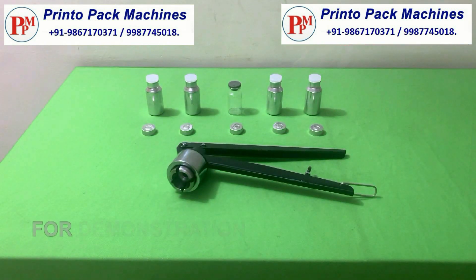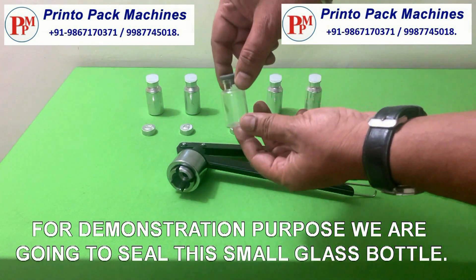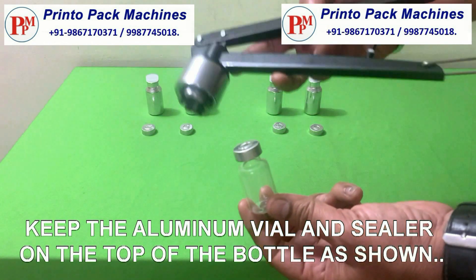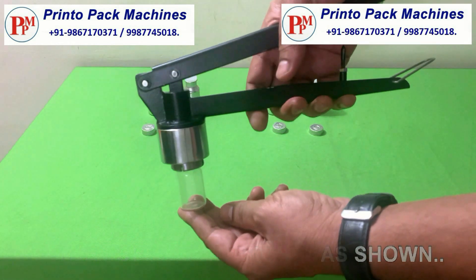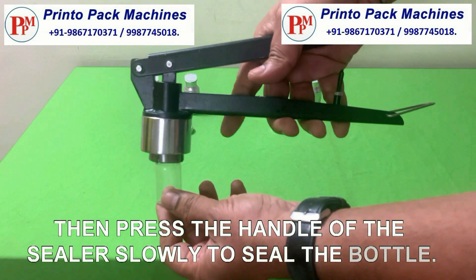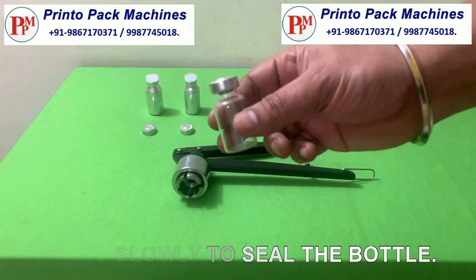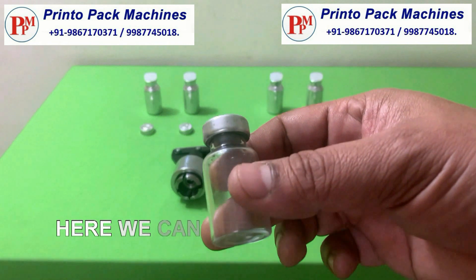For demonstration purposes we are going to seal this small glass bottle. Keep the Aluminum Vial and sealer on the top of the bottle as shown. Then press the handle of the sealer slowly to seal the bottle. Here we can see the bottle is sealed properly and perfectly.